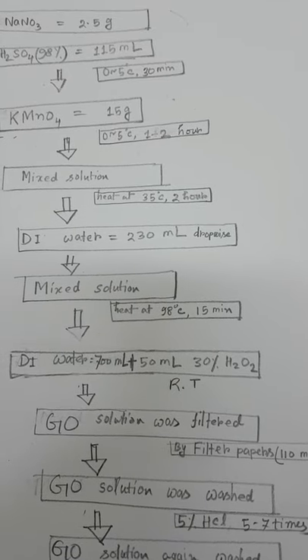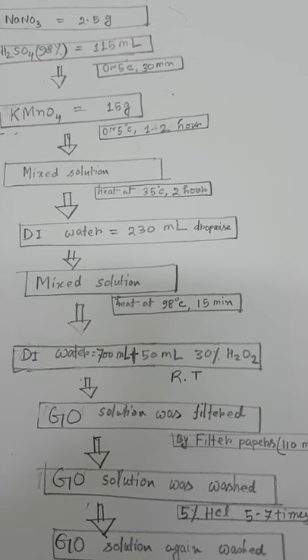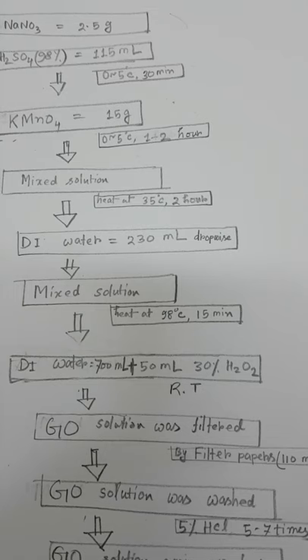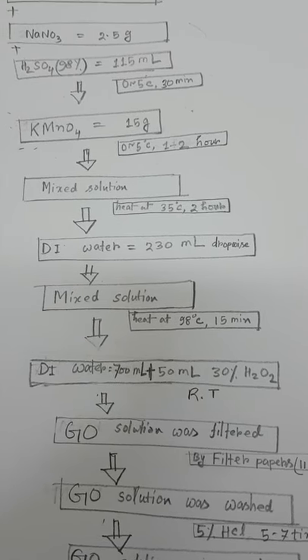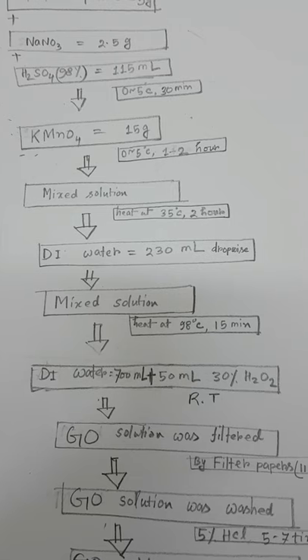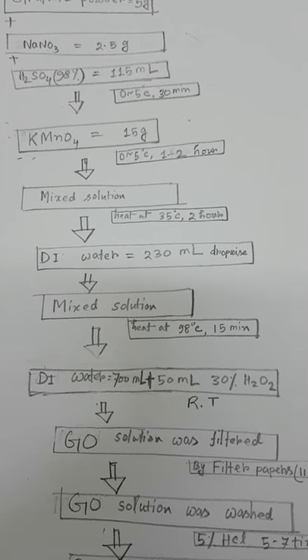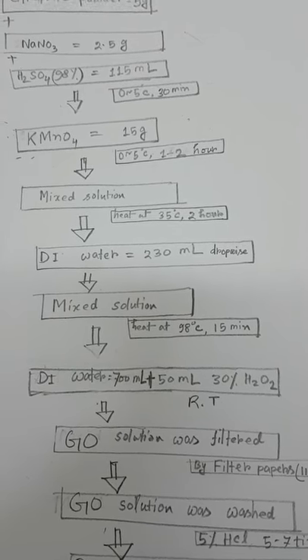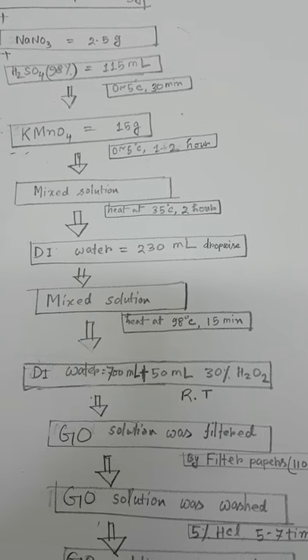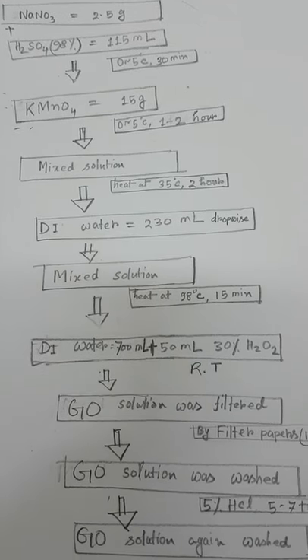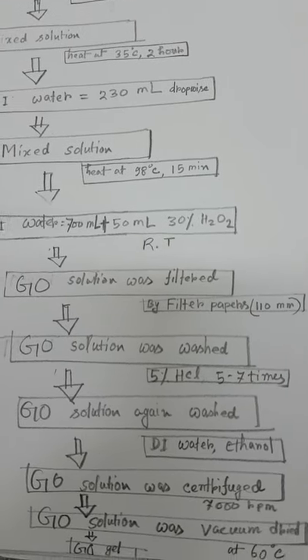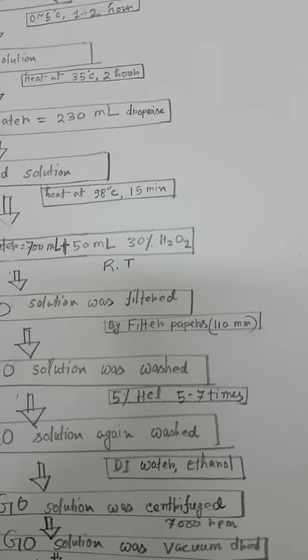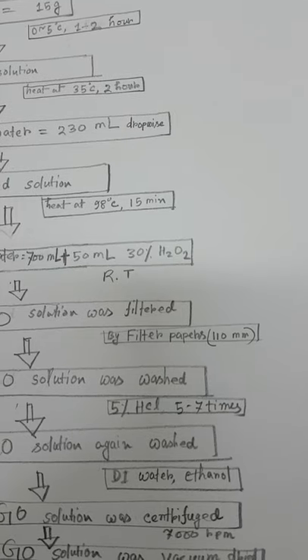After that, this mixed precursor solution has remaining sulfate ions and manganese ions, so we have to remove them. To remove it, we use filtration with filter paper. The pore size was 110 millimeters.